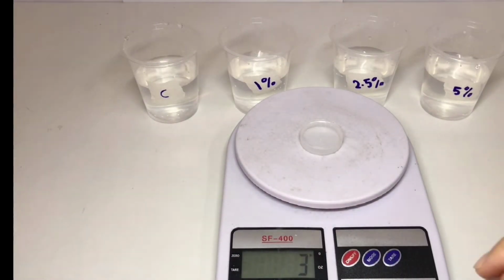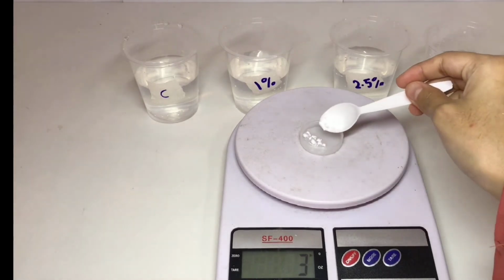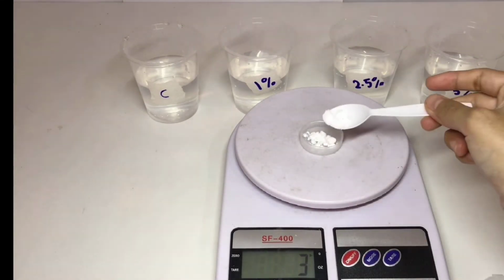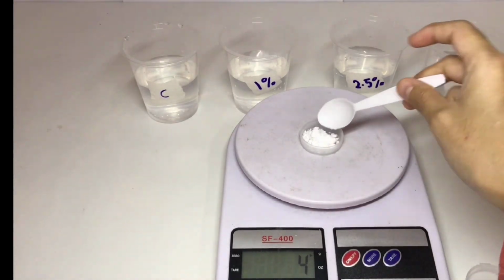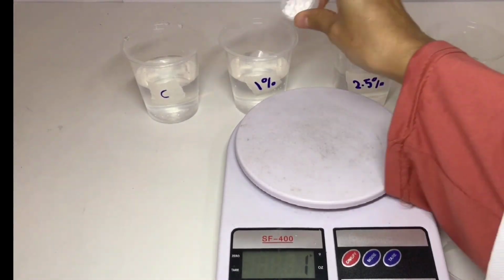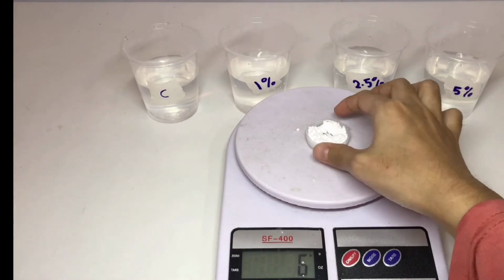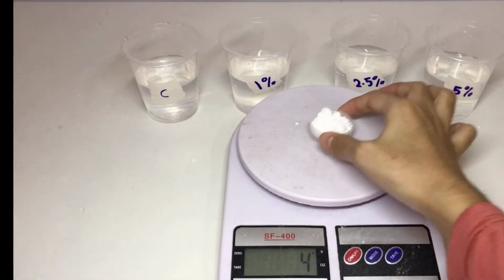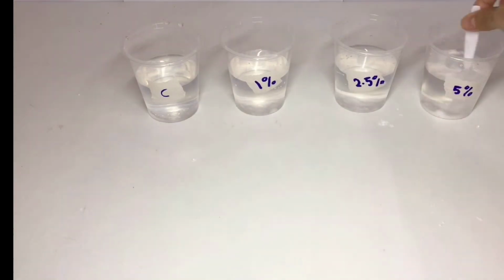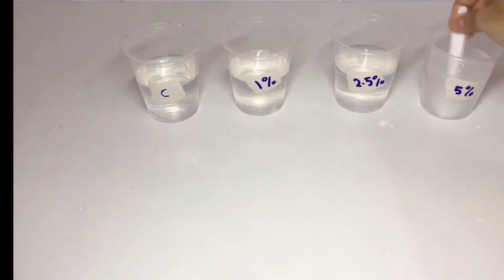To prepare 1% weight over volume sodium bicarbonate solution, I dissolve 1 gram of sodium bicarbonate into 100 ml of distilled water. And the same goes for 2.5% and 5% weight over volume sodium bicarbonate solution, with 2.5 gram and 5 gram of sodium bicarbonate added to each beaker.